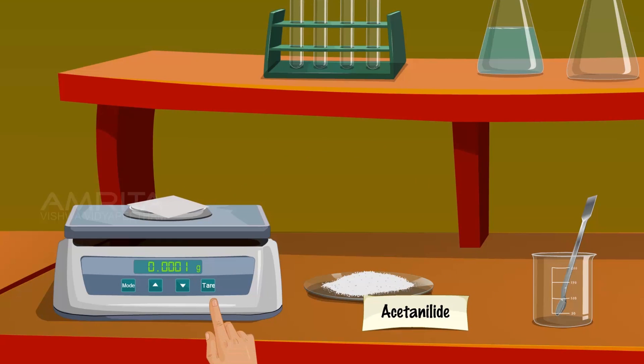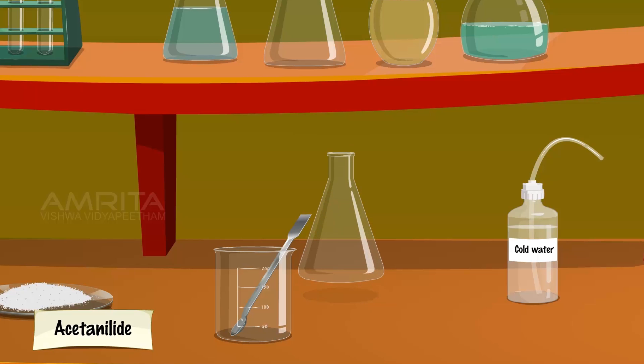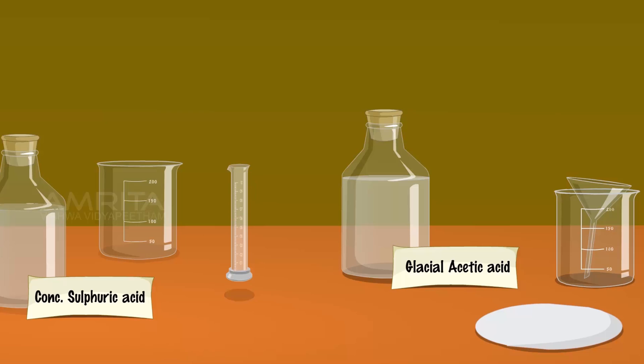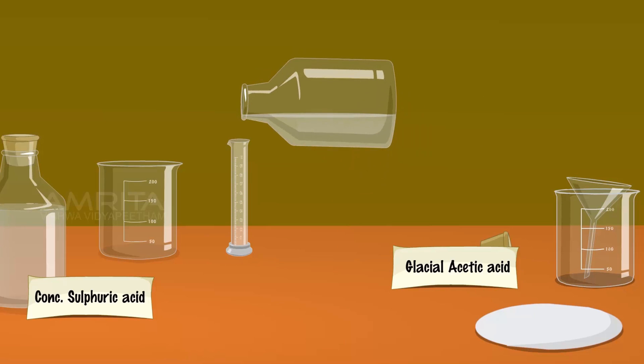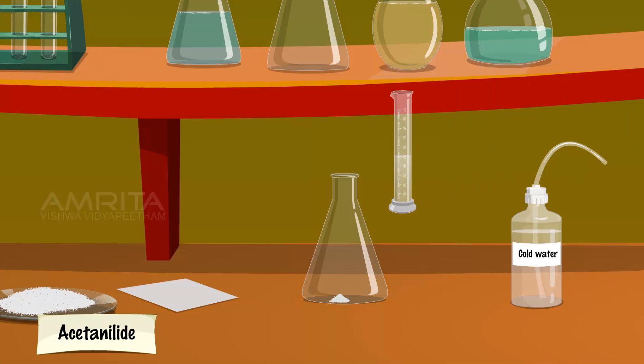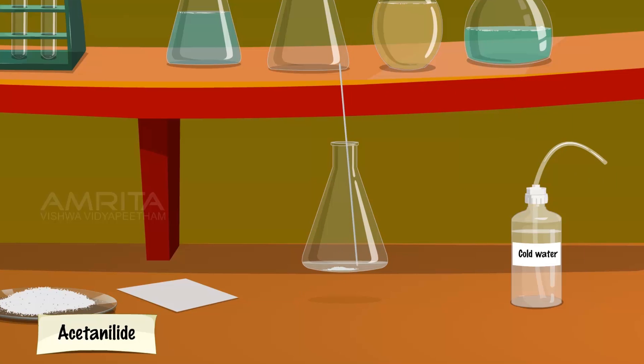Place a butter paper over an electronic balance and tare the balance. Weigh 5 grams of acetanilide and using the spatula, transfer the weighed quantity of acetanilide into a conical flask. Take 5 ml of glacial acetic acid in a measuring jar and pour it into the conical flask. Stir the contents of the flask using a glass rod.